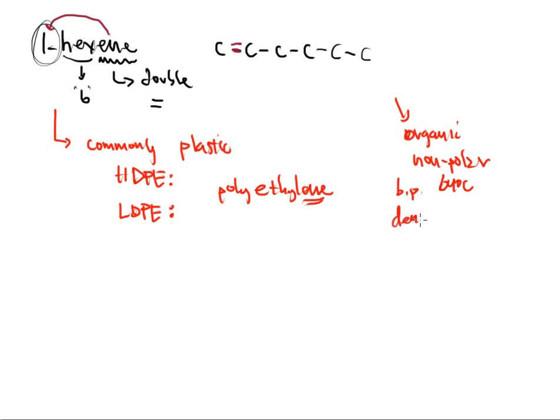The density here is 0.678 on average gram per milliliter. This is less than the density of water, which again is very traditional when it comes to an organic molecule. And the formula weight for 1-hexene, you can look this up in Wikipedia or the Merck, but that's 84.16 gram per mole. So all carbon, all hydrogen across the board. So there's a little bit of background about 1-hexene.